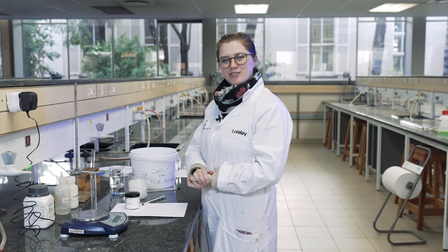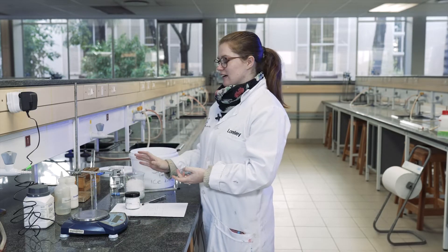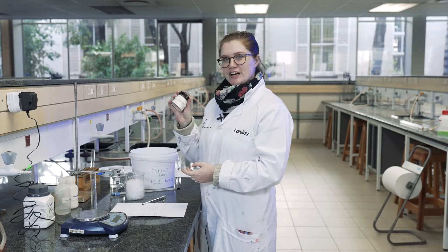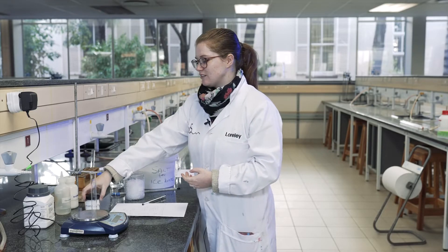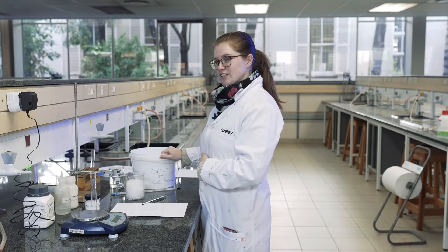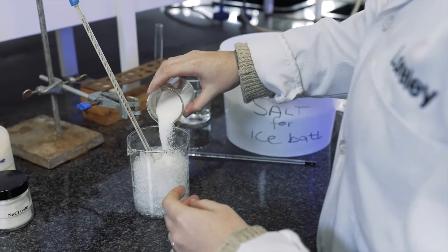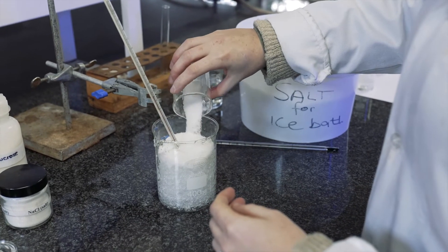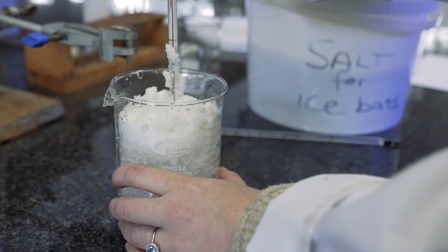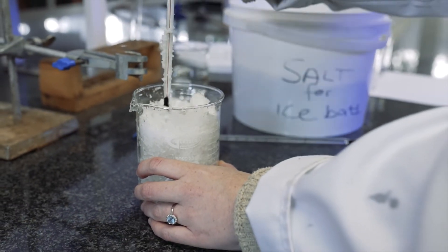Now that we've prepared our solutions, we can prepare an ice bath. We're going to use ice and fill it up with about a centimeter of impure salt. You'll notice we used a very high grade of salt when preparing our solutions, but for the ice bath we're going to use impure salt. You can already see that the ice is colder at the top than at the bottom because it's frozen solid instead of ice chips.